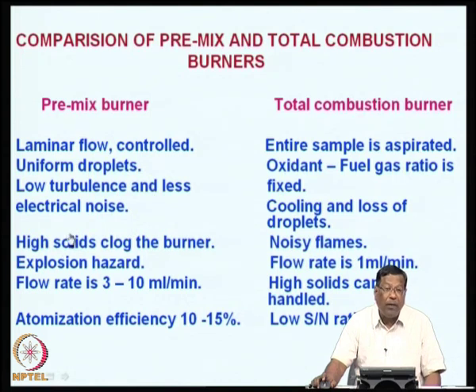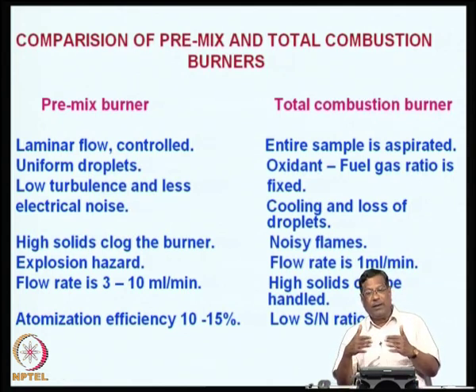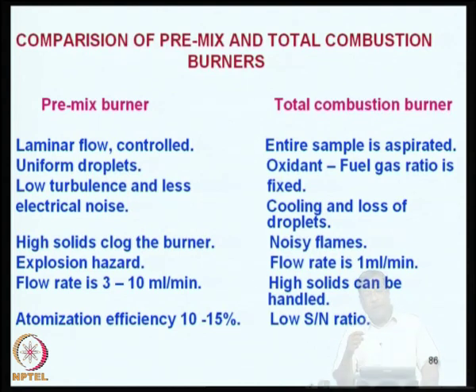Suppose you have high solids, it clogs the burner, because when it comes near the edge of the burner, these high solids will stick to the burner slot, and the gas will not be burning comfortably. So, there will be gaps and then stoppages, and then the gas may extinguish or it may backfire due to pressure when the gas is not burning, but it is coming inside the burner. So, this is a slight disadvantage of the premix burner.